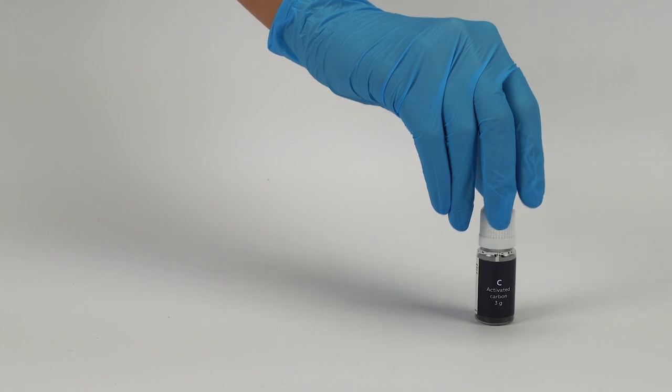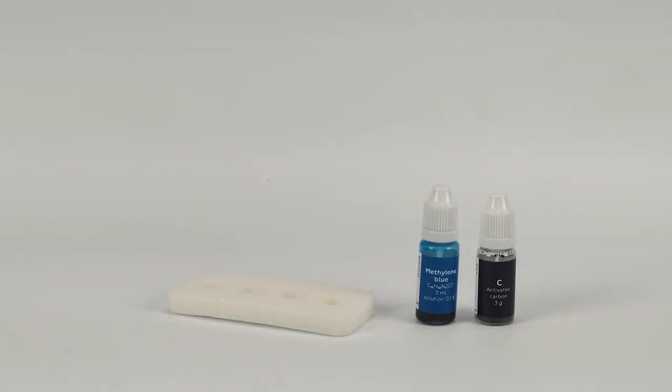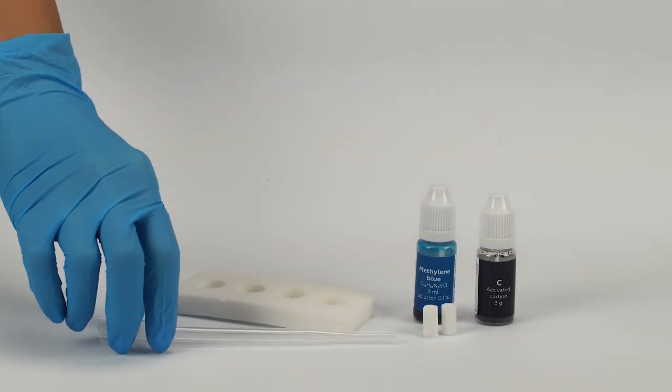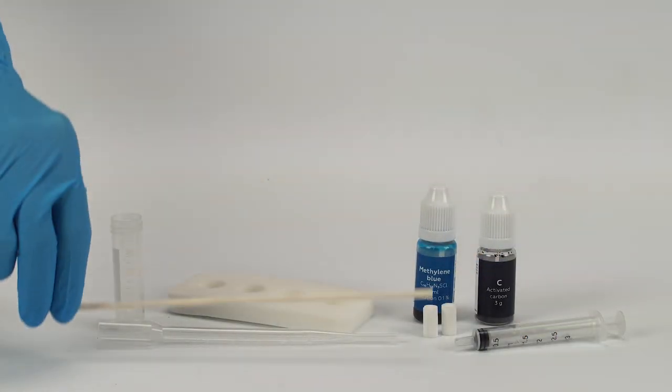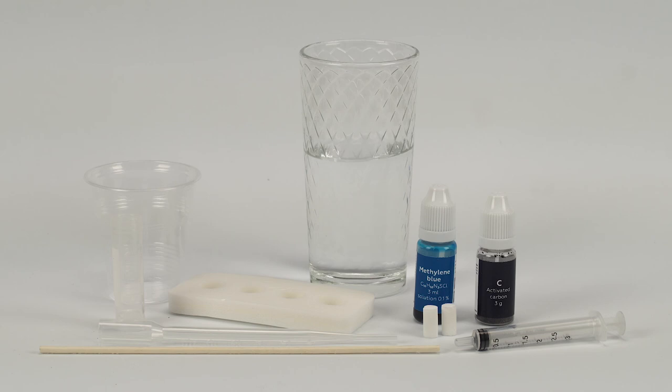For the carbon filter experiment, you will need a bottle of activated carbon and methylene blue solution. Take the vial stand, two small cotton cylinders, a filter body, a plastic vial, a syringe, and a wooden stick from the experiment set. Take a plastic cup from the starter kit. Also, prepare some water in advance.